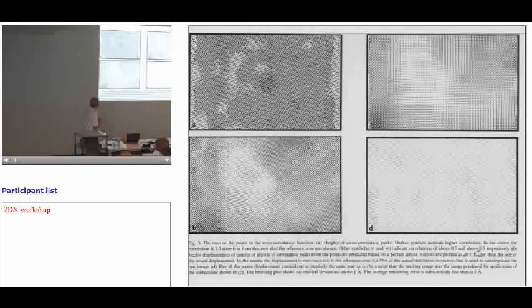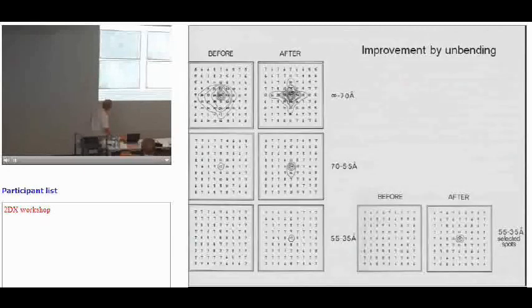So then we used to fit, although in the end, it sometimes made it better, sometimes didn't, a continuous sort of elastic function involving a bicubic spline with knots, and it came out on a square lattice, and if you subtracted the 2, you could see how well you'd corrected it. But you were essentially not allowing sharp transitions. But of course, some crystals have cracks in them, and you want sharp transitions. So in fact, in the end, this smoothing and so on was only used in some of the pictures.